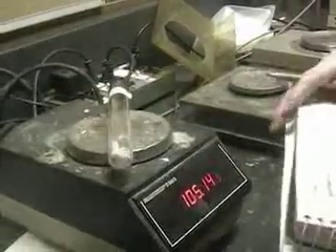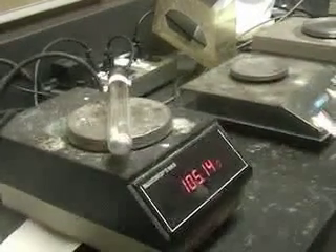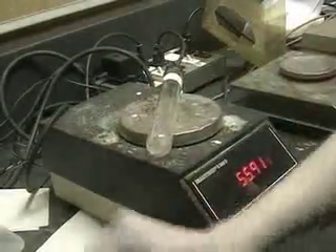In the first part of the experiment, we'll find the specific heat of a metal by taking a hot metal, putting it into cold water, and see how much heat it releases. We'll measure this by calculating the amount of heat that is absorbed by the water. The first thing we need to know is the mass of the unknown metal. We find this by the difference — the difference of the mass of the test tube with the metal in it and the empty test tube.